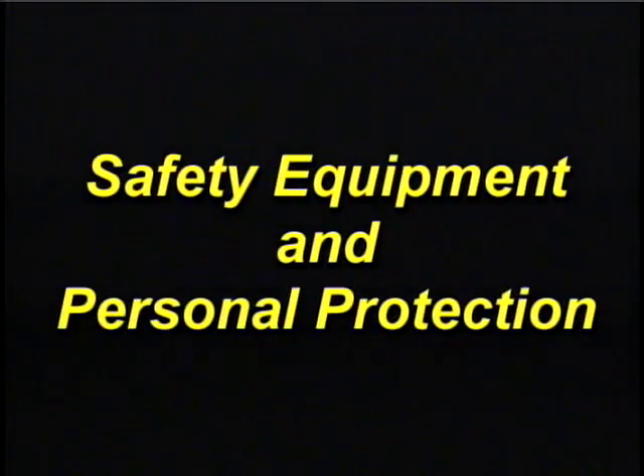The first section of this video deals with safety equipment and personal protection. We'll start out by looking at some of the safety equipment in the lab. Because each lab room has this equipment in slightly different locations, you're going to want to know exactly where it is in your particular lab room. You're going to need to know how to use the equipment and what it's for in most cases.